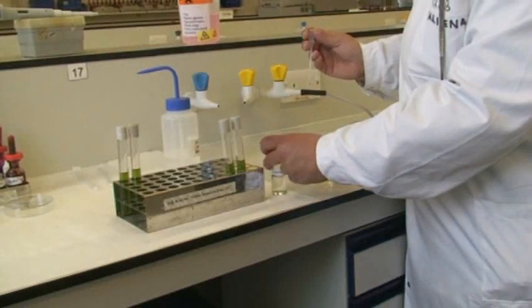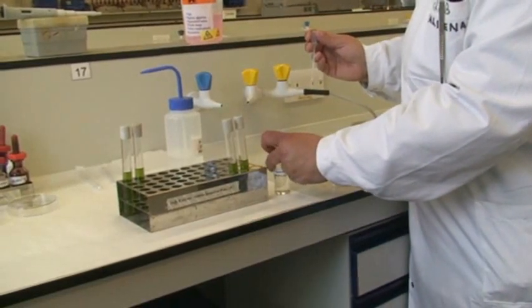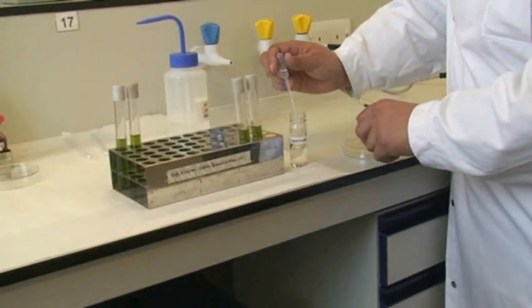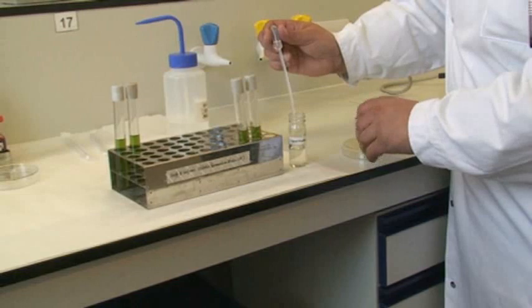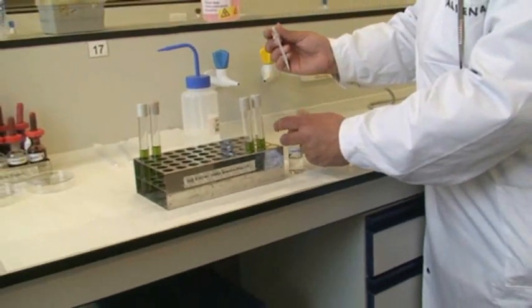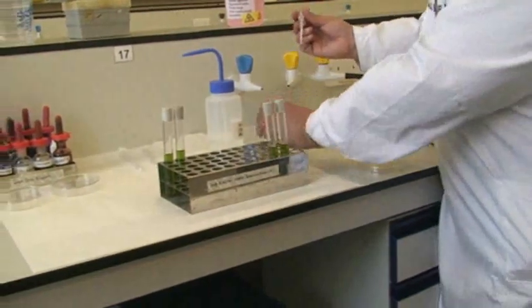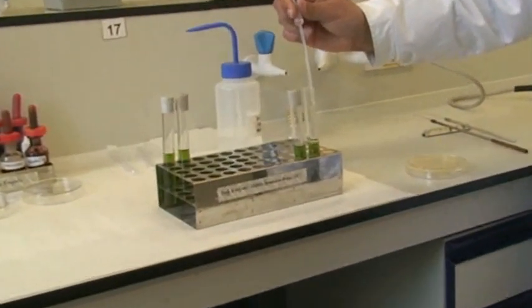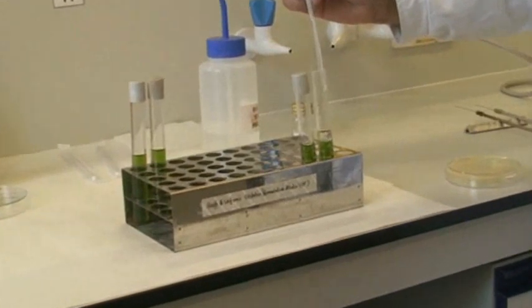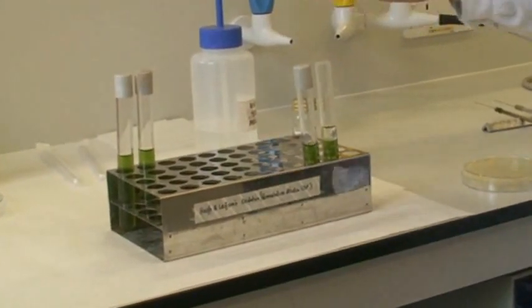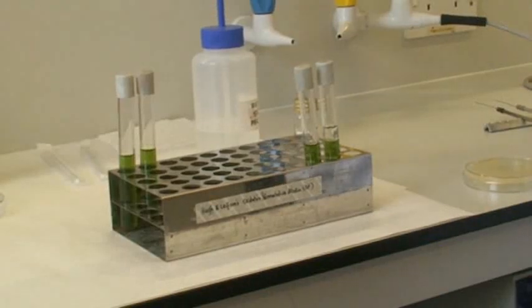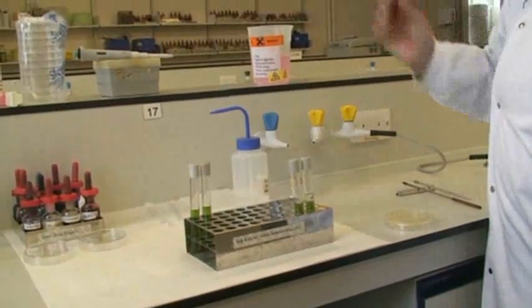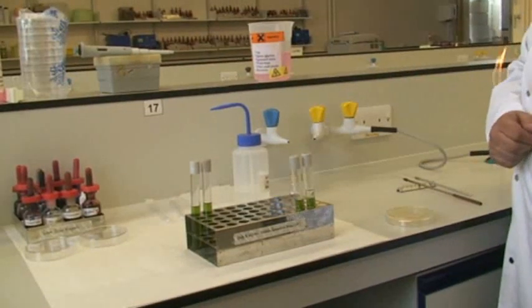So taking some liquid paraffin, probably needs about that much, and then just topping up one of those tubes with paraffin oil just to simulate anaerobic conditions. And that would be sufficient paraffin oil there. And then discarding this into your beaker, and that's ready for incubation. Thank you.